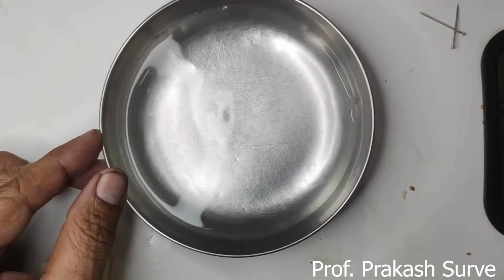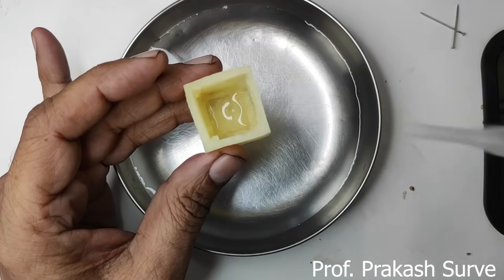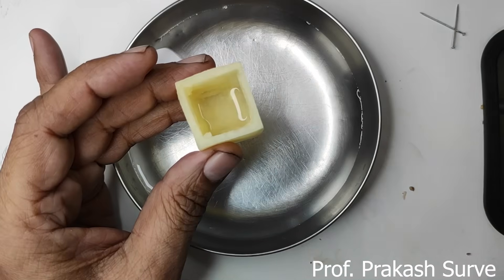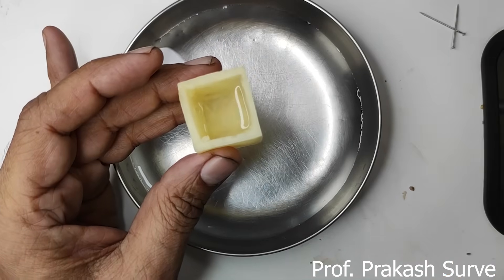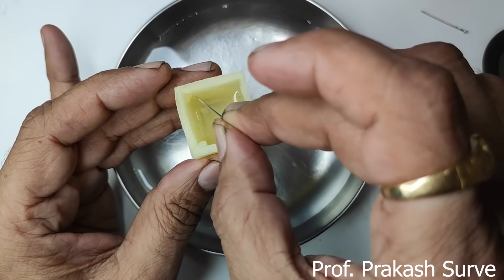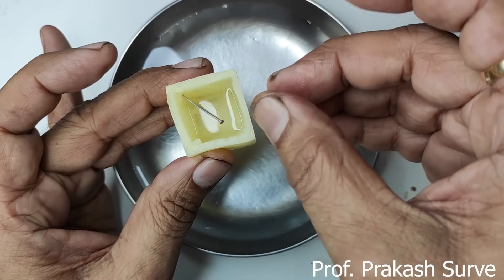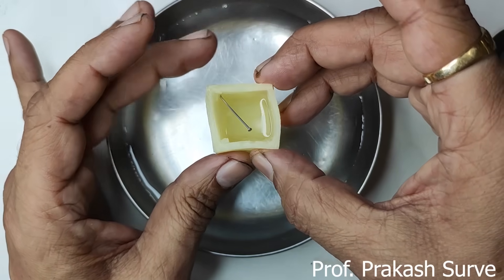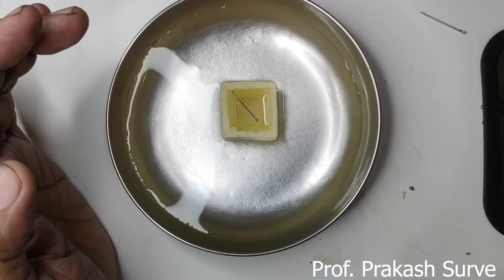Now, in the potato osmoscope I will pour the hypertonic solution made of salt, filling it halfway. Then I will use a pin to mark the level of the salt solution inside. Slowly pin it — don't push it all the way through, otherwise there will be leakage. So here we have marked the level where the salt solution is. Now I will keep this osmoscope in the plate of water, which is the hypotonic solution.